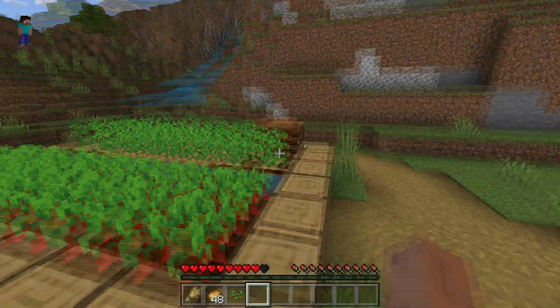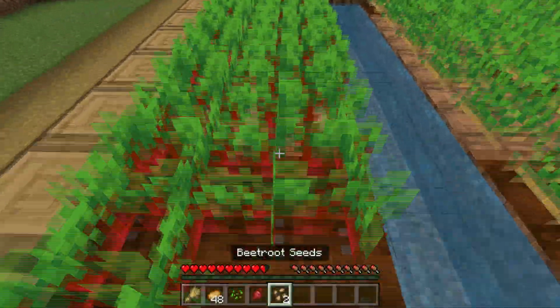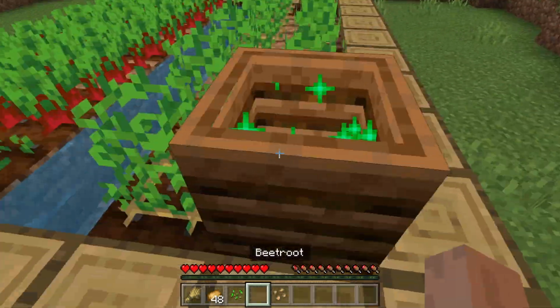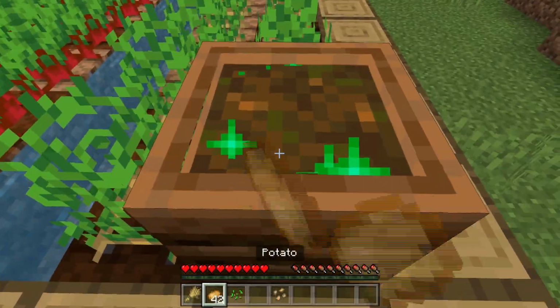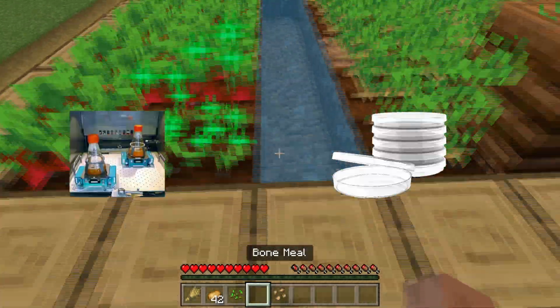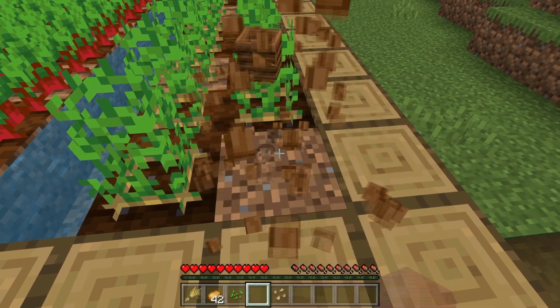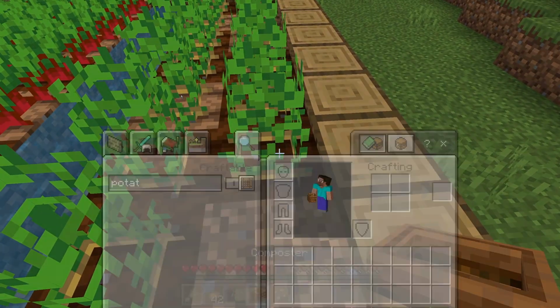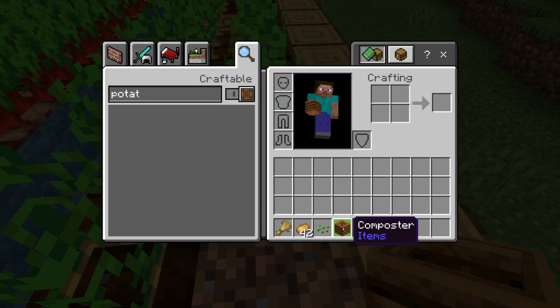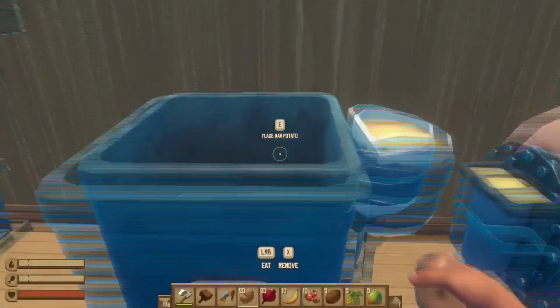So while a composter is one of the easier and more memorable examples of a bioreactor at home, it's not the only one. And compost is not the only thing you can make. Things like a shake flask or petri dish can technically even be counted as a bioreactor. A bioreactor is a word that's far more sophisticated than what it actually is, but they can be very simple, and they can even be bigger.